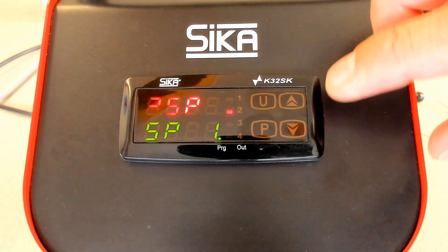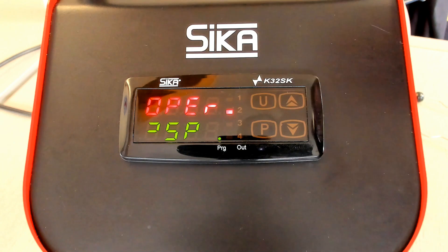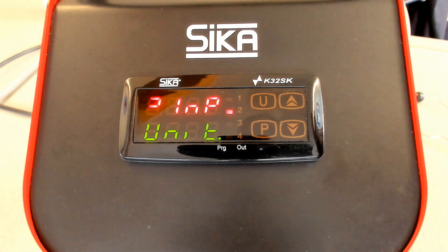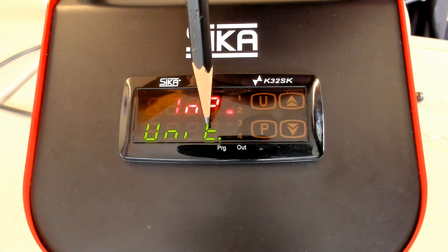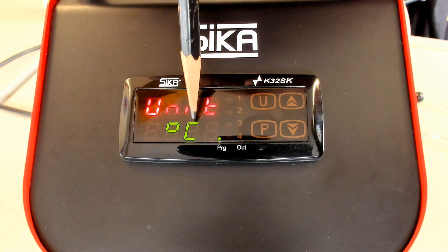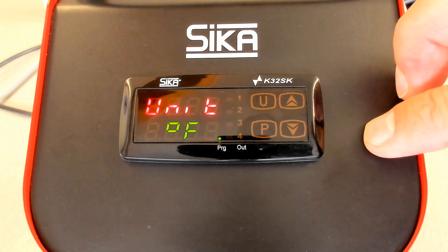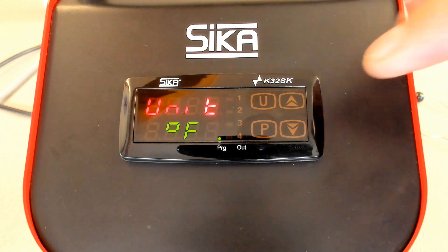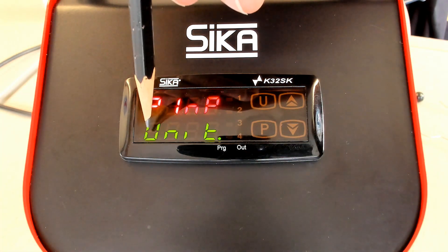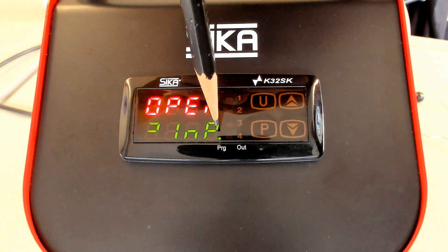If you like to go back, you have to wait 15 seconds, or push and hold the UP key, and then you come back to the set point group. If you go to the input group and push P, you see the parameter called UNIT. Push P to enter, and you see the unit is centigrade. You can switch from centigrade to Fahrenheit and back — so you can select the engineering unit. In our case we select centigrade, confirm the value, and push and hold the UP key to return to the group in the operator menu.